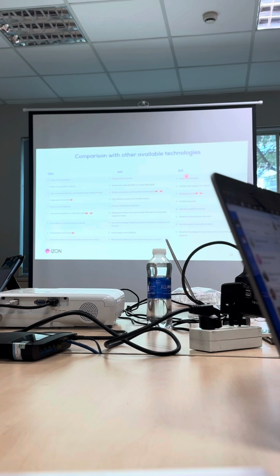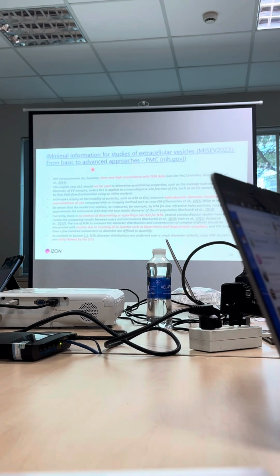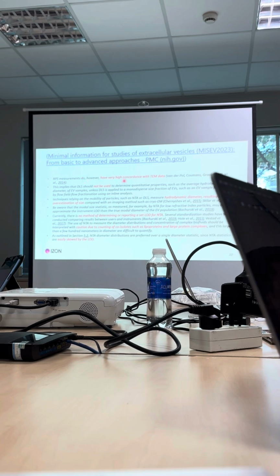So that is a guideline set, a very important guideline. When we do publications, we need to refer to the guideline. This one is from the International Society of Extracellular Vesicles. They published the guideline for researchers. So you see here, TRPS, or our TRPS, has what? This is not our own; this is just a quote from the guideline.